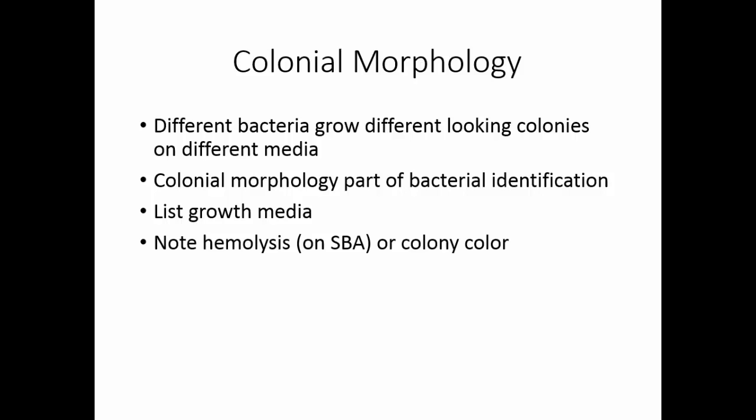anything about the colony, like its color if it's on a certain media, or if it's on sheep blood agar, did it provide any kind of hemolysis of the agar. Then you'll want to describe colonial form, elevation, and margin.